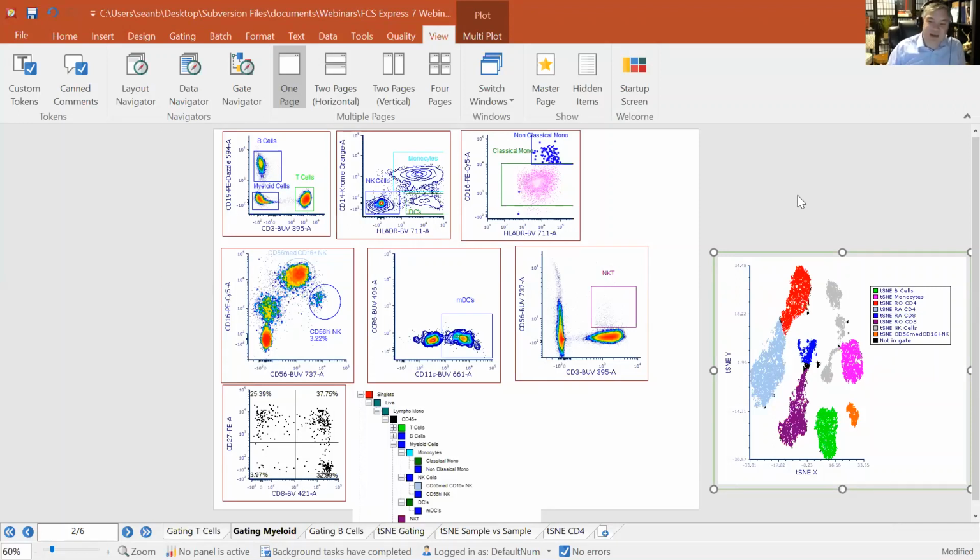So again, you use these back and forth, right? In some cases people just use t-SNE charts, but more often than not, you're going to be using t-SNE charts along with classical flow cytometry data analysis, using them side by side to get the benefits of each of them. Coming back to it, I'd never be able to look at this plot and say, that's RAs and that's ROs, but I could probably say, that's my CD4s altogether. But I need backgating to go in and further define where there are subpopulations within a major cluster itself.